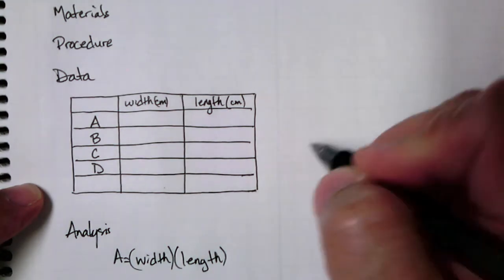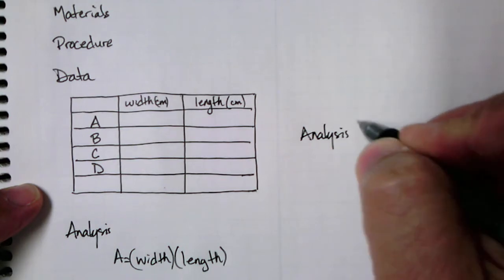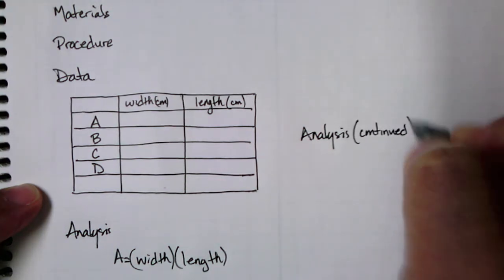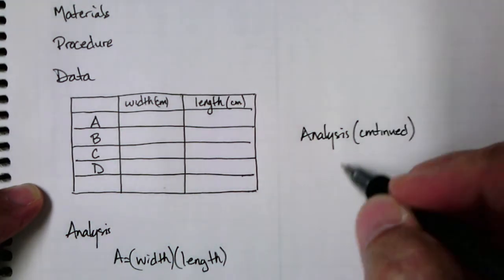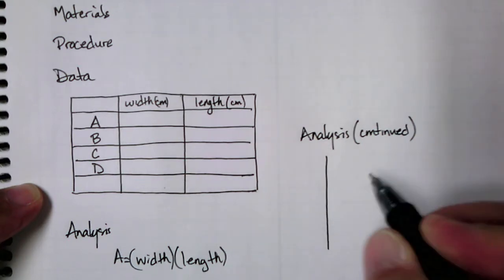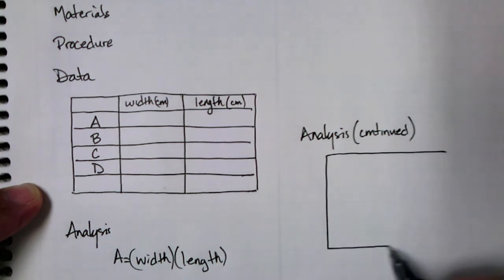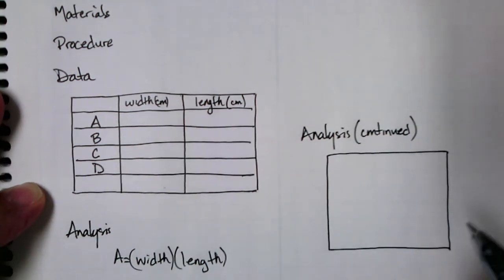So I'm going to come over here, and I'm going to say analysis continued. And I am going to generate a table for my analysis. Like that.